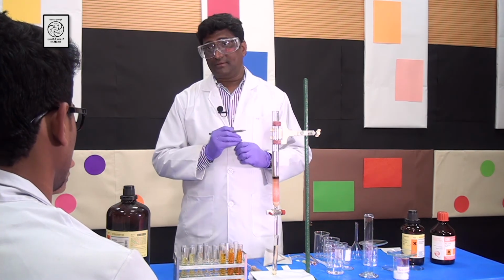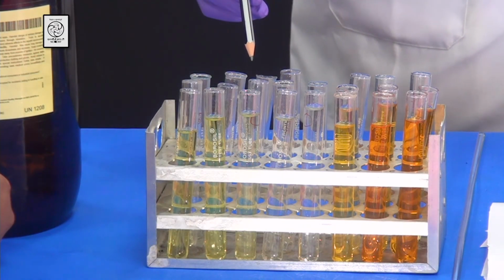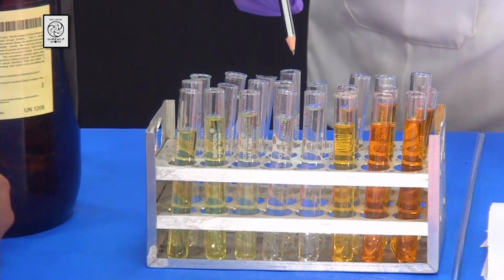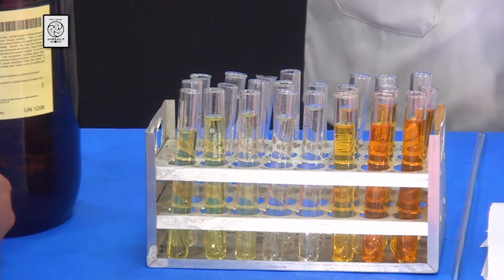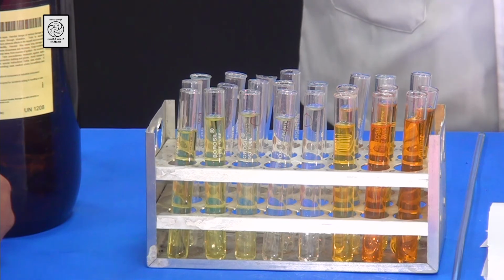I am showing them here. The first three test tubes contain the yellow compound, which is compound A, and then the fourth and fifth test tubes do not contain any compound. Then the remaining test tubes contain compound B, which is a red compound, but the compound appears dark orange because it is in diluted form.